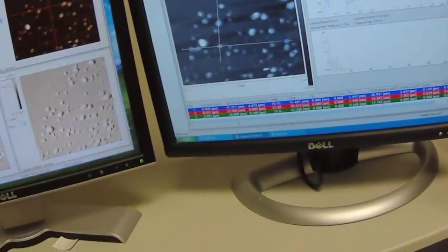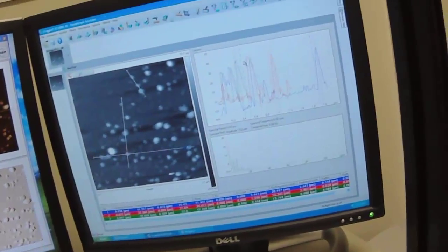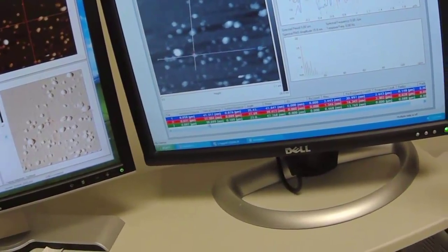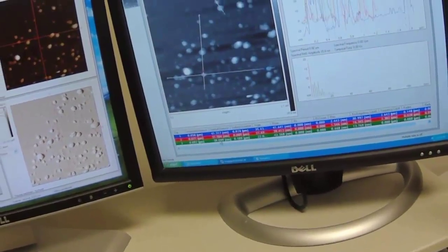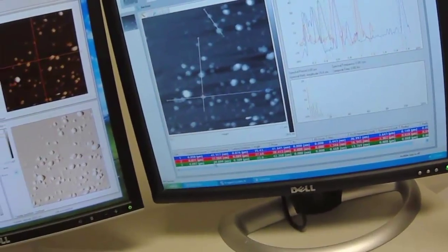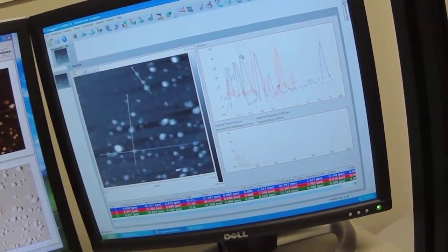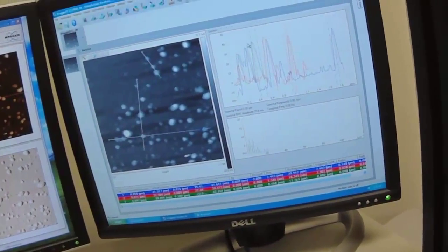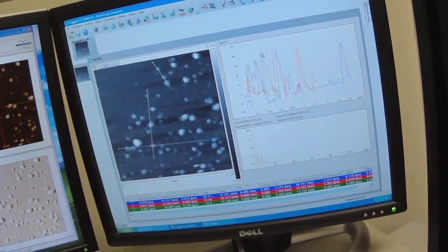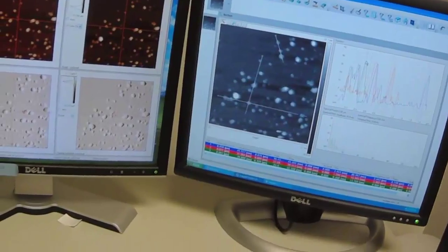And so now I switched the order of these two green cursors. So now it tells me that the vertical distance, the difference between the lines is negative 39 because it started here and went down to here. But the peak is actually 39 nanometers tall.